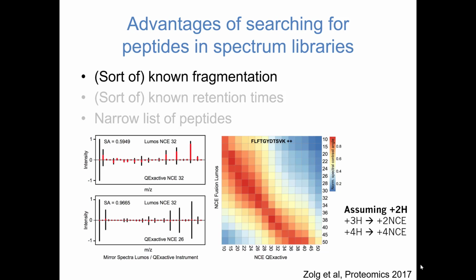Yeah, but within a spectrum, doesn't Skyline rank transitions compared to one another? Why should we care so much about absolute intensities in this spectrum as long as relatively they stay the same? Yeah. And I would offer that two ways. Yes, it will select transitions based off of that, and so you will end up with the top 6, and maybe those transitions are there.